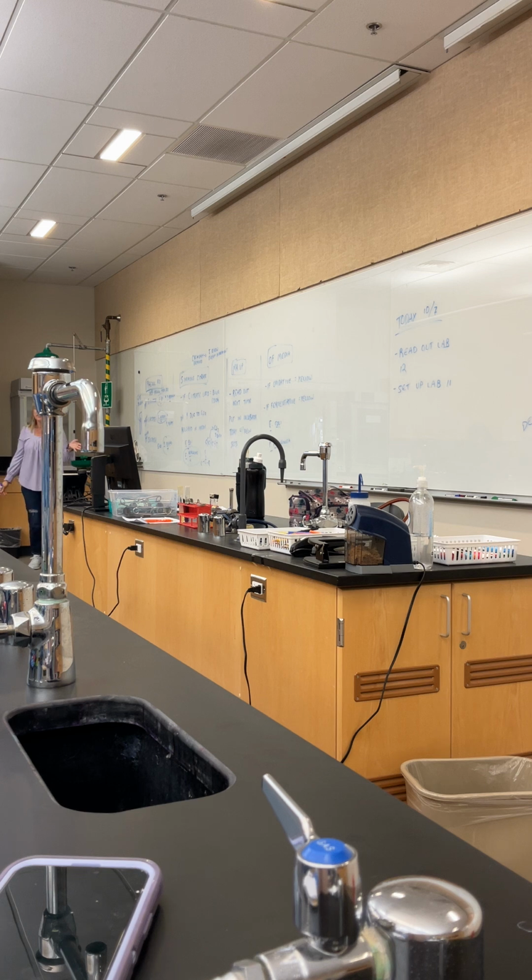So questions that I would ask on a lab exam. You set up Simmons citrate. You come in the next day. You see an organism that has turned blue. Which organism was positive for a blue color? Well, first of all, I could ask you, is blue positive or negative? And then I could ask you, which organism do we see in the lab that caused a positive reaction? And then I could ask you, which organism was negative? So these are the kind of things you want to study.